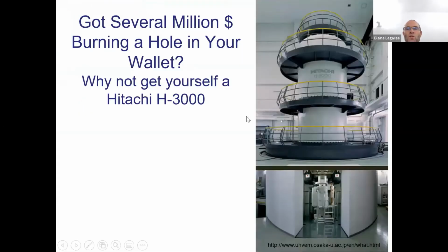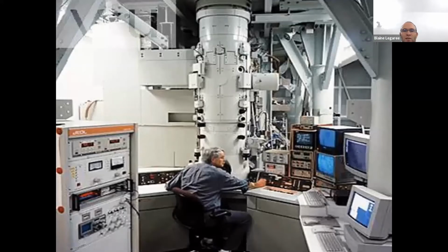Okay, so, oh yeah, I wanted to show you this. This is apparently the world's largest transmission electron microscope. I don't know how much it costs. You can call it Hitachi if you want. They're in Japan. But if you take a careful look, those are railings. So this thing is like 3 stories high. It's massive. There's a guy using it.